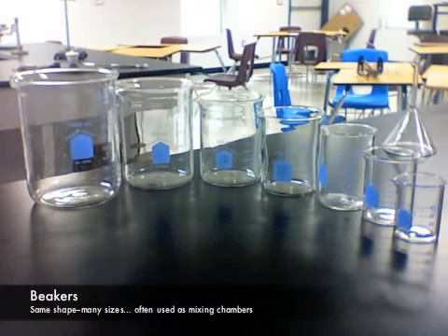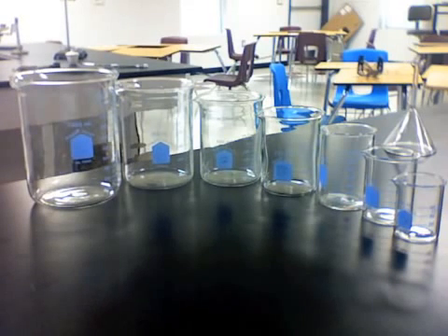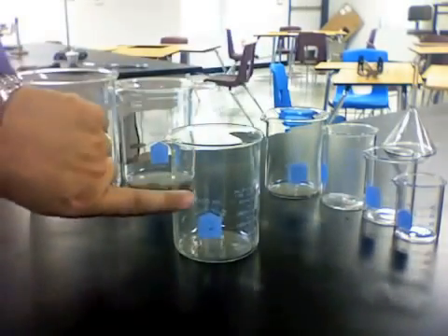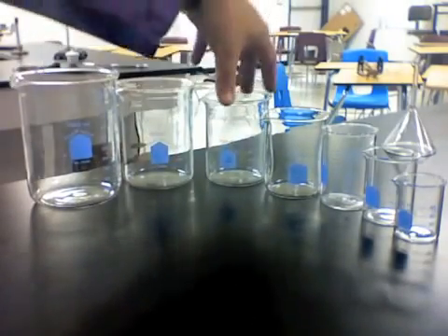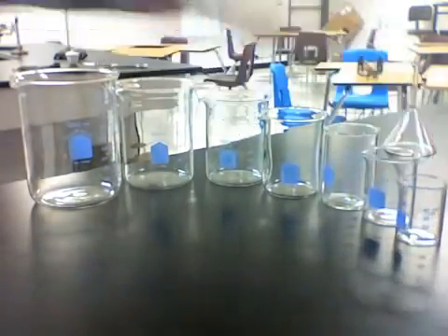Okay, you probably recognize these. They're beakers. They're not jars, they're not bottles, they're not flasks, they're beakers. Beakers can come in lots of different sizes, and we measure the volume of the liquid inside in milliliters. So when Mr. Womack says go get a 400 ml beaker, he means this beaker right here that holds up to 400 milliliters. We have them in 1,000 ml, 600, 400, 250, and 150 ml beakers.